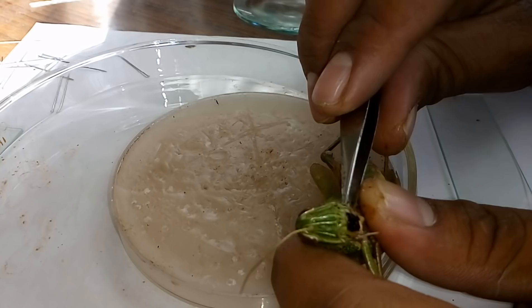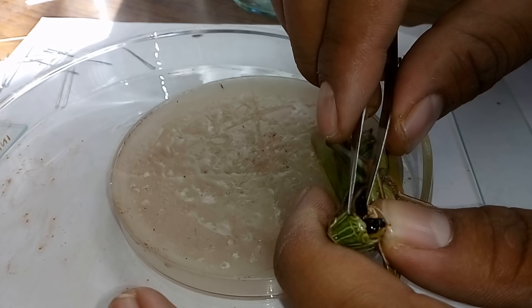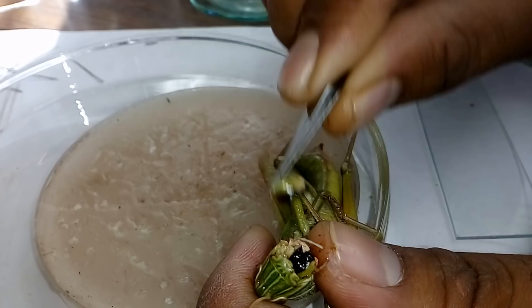Now we have to remove the mandible. Look at these black structures — these are the mandibles. There is one pair of mandibles, so I'm removing only one side — the left mandible. This is the left mandible. Look at its areas — very strong, just for biting and chewing. We put our mandible into alcohol.